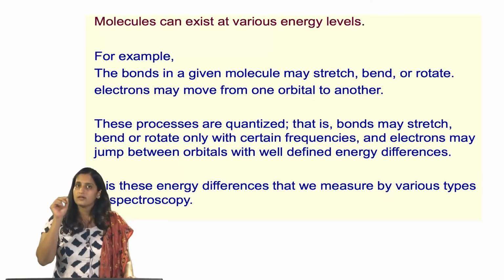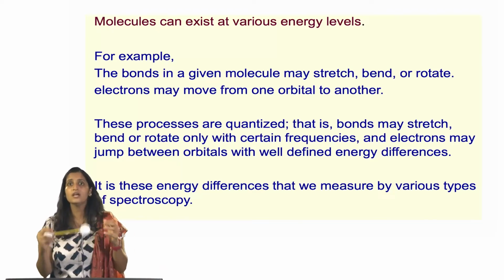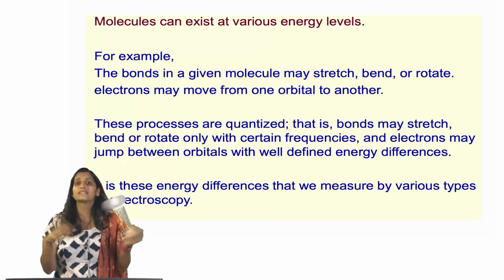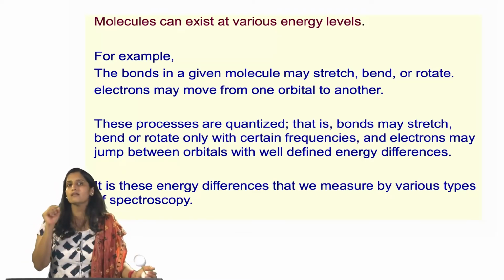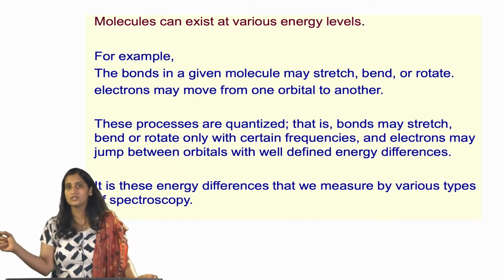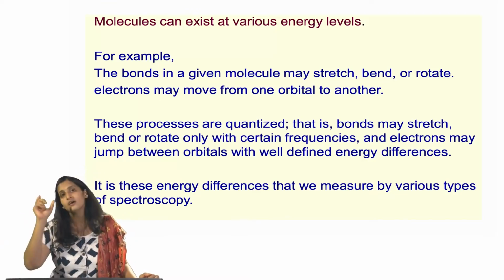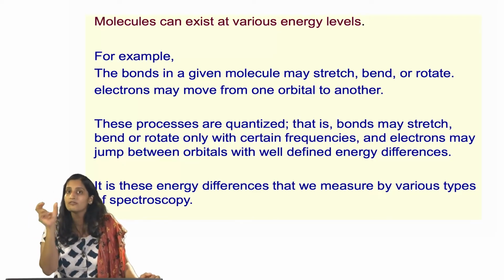Let's say you take a molecule, you shine light on it, you give it energy. How did the bonds in this particular molecule, or how did the electrons in this particular molecule start vibrating, rotating, stretching, bending? All of these things we can measure with the help of the energy difference. Because remember, when we talked about E equals h nu, the frequency is going to be proportional to that energy. And depending on how much is the change, the energy difference, we can really understand what kind of bond is present.